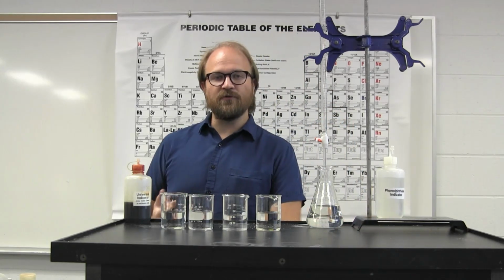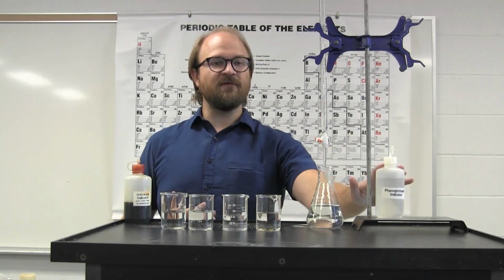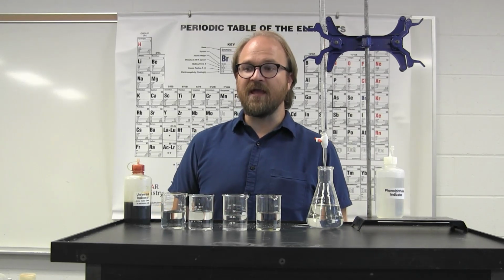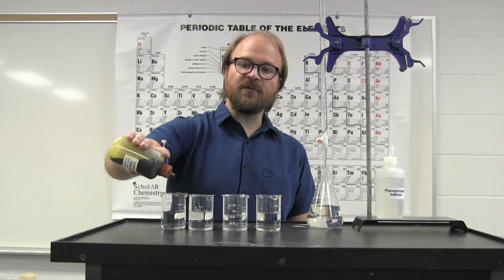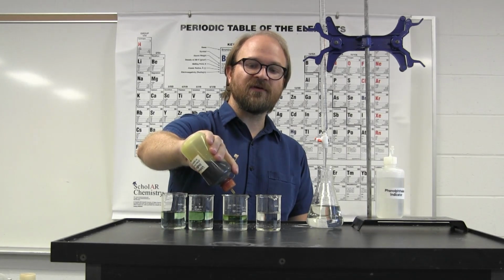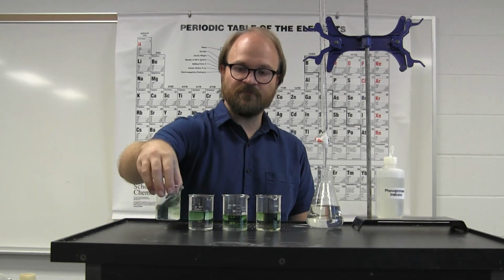The indicator used in the simulation and in many titrations is phenolphthalein. But there are a number of different indicators that can change color depending on the pH. Universal indicator is a blend of a few different indicator solutions in order to cover a full range of pH or acid concentrations.